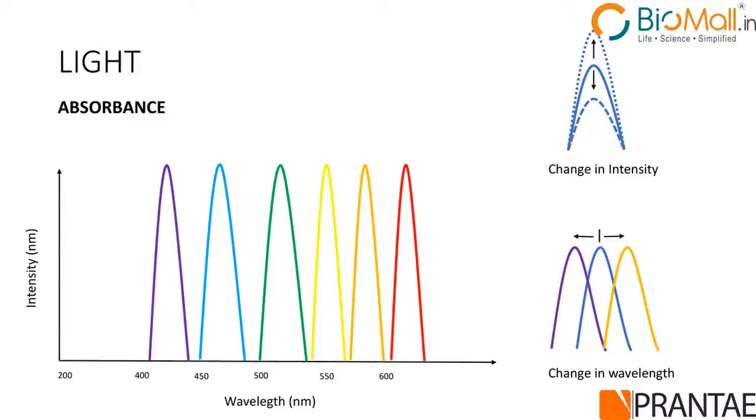Okay. So now, if this particular molecule that absorbs light is used as a sensor for transducing the light signal, or transducing anything, then with absorbance molecules there are only two ways this molecule can behave in response to your sensing activity. The first is a change in intensity. That means, compared to a resting state of the spectral feature, which is composed of the wavelength and the intensity at a particular wavelength, the intensity can go up or it can go down.